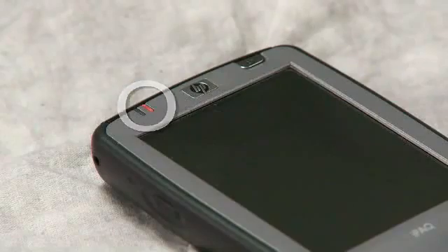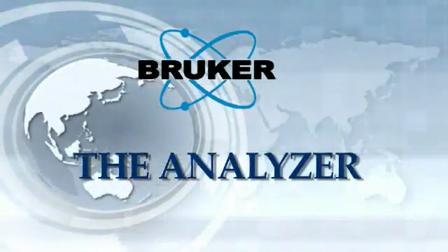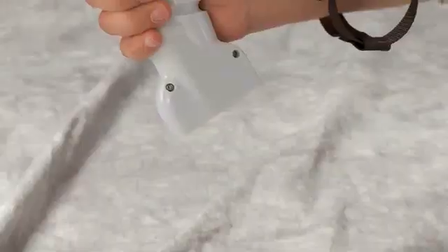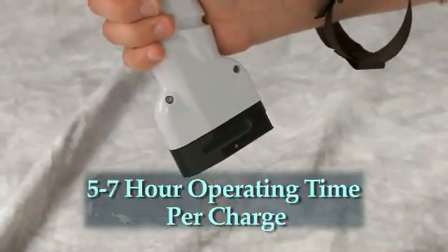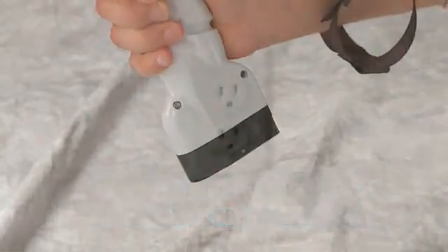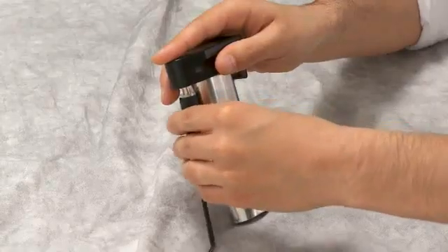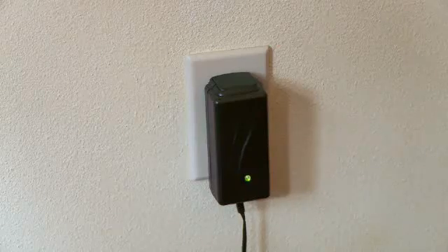While the PDA is charging, the orange light in the upper left corner will blink. When the PDA is completely charged, the orange light will be constant. Two lithium ion batteries are supplied with the analyzer. Each battery, when combined with a fully charged PDA, can operate the analyzer for five to seven hours. To charge the analyzer's battery, plug the battery charger into an AC line and then into the battery. While the battery is charging, the light on the charger will blink. When fully charged, the charger light will be on constantly.